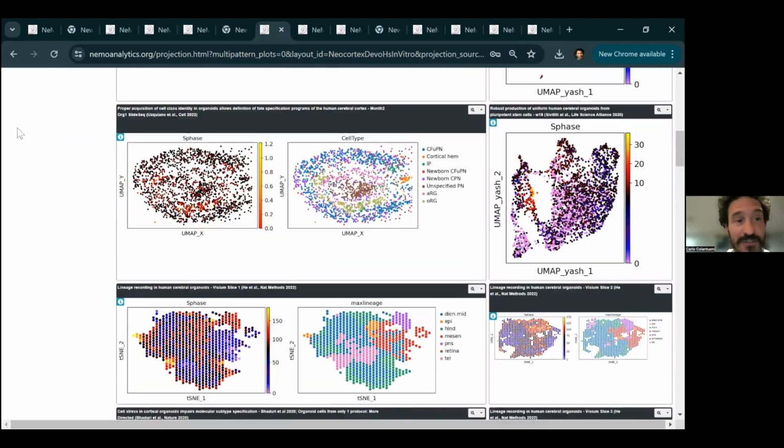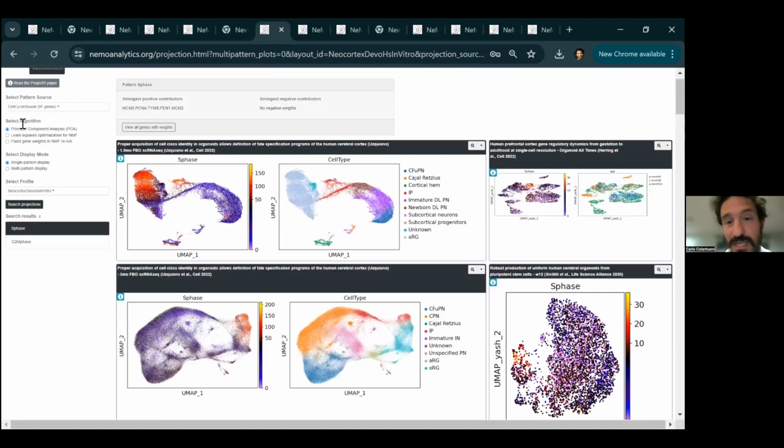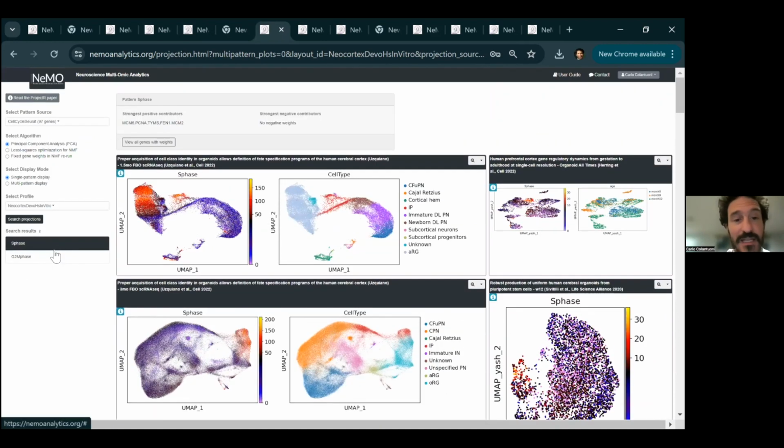And now, instead of having a single gene here, we can have any list of genes we would like. And that could be as simple as your 5 favorite genes. And in this case, we have S phase genes and G2M phase genes. So for instance, here you could see the S phase is right there. So of course, these are progenitors moving forward to those neurons. But you could imagine a whole list of other things here that might be CHIR, XAV or CHIR dosage and the genes associated with them.